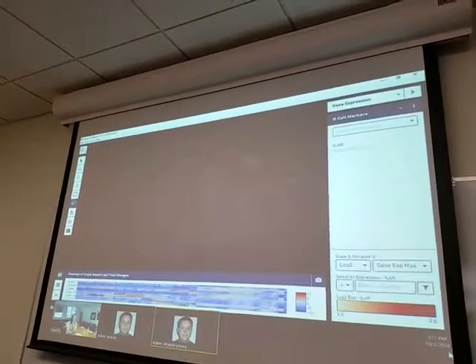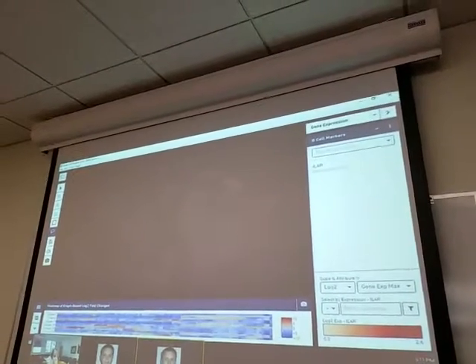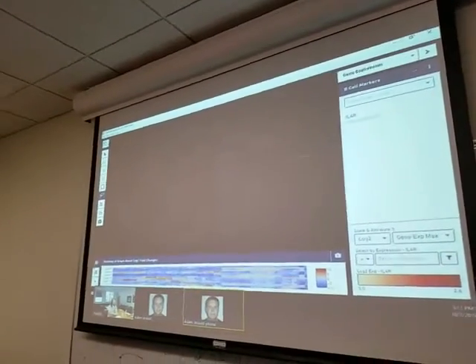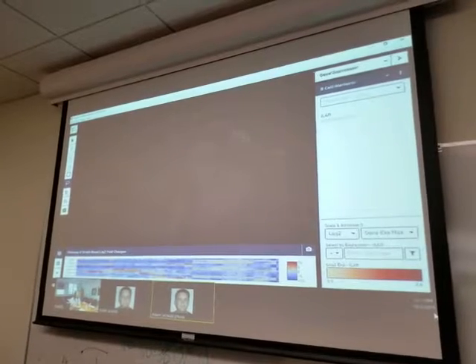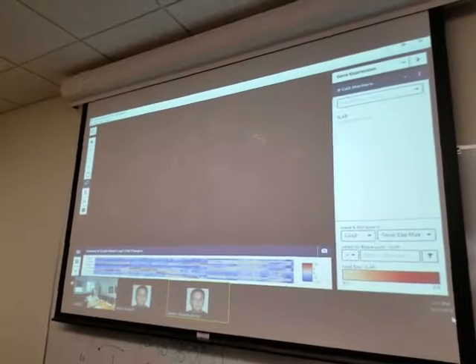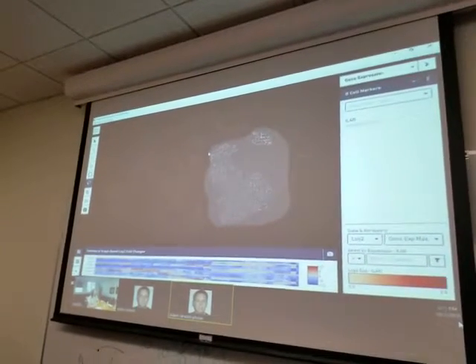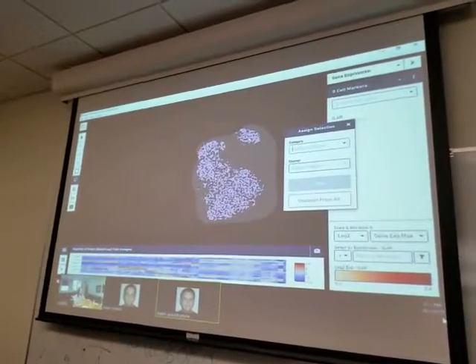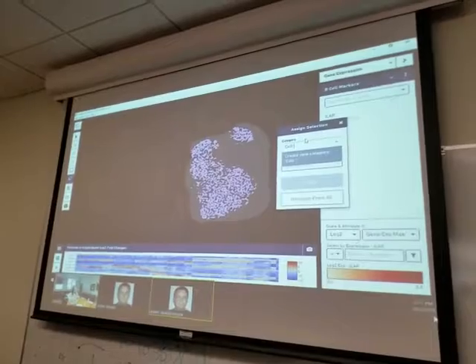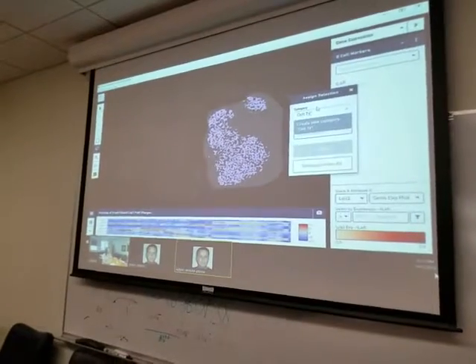Right. So how could we pull those out and analyze them? I don't know how many there are, but I think it's a number somewhere there. Yep. So you can use whatever method you want to identify them. So we use the IL-4 receptor and said, okay, we're interested in this cluster and this cluster. And so that's where the lasso tool comes into play, and I can just lasso around it. This is the way I think it's easiest. And now I've sort of identified these two clusters, and I give the category whatever name I want.